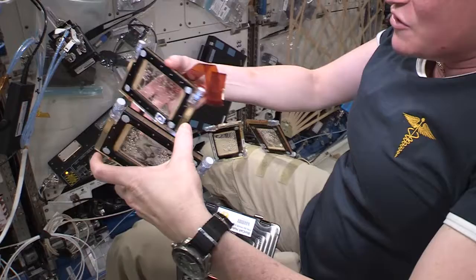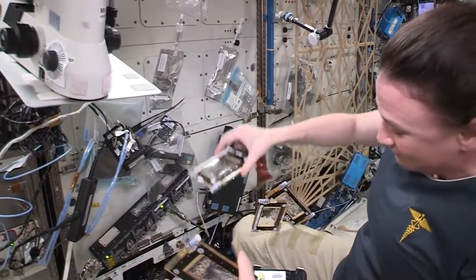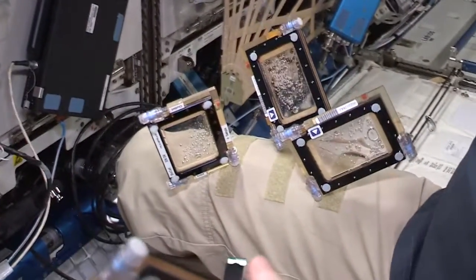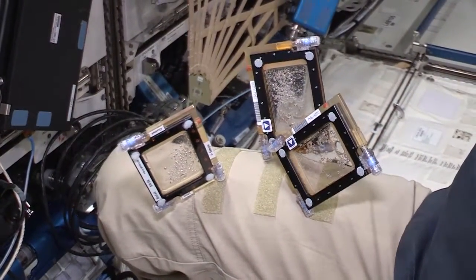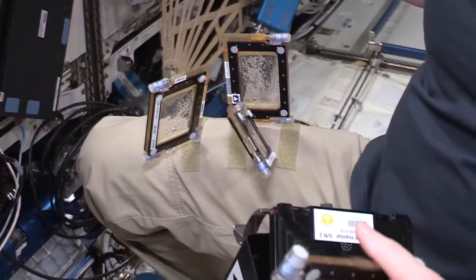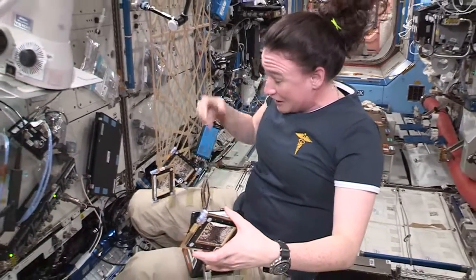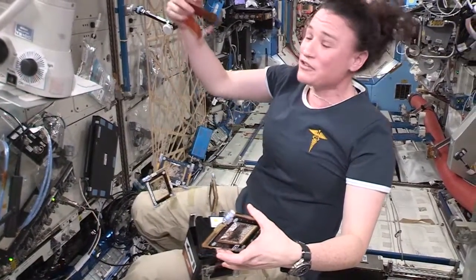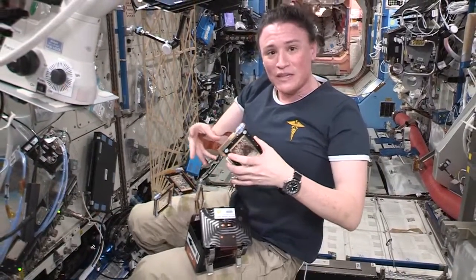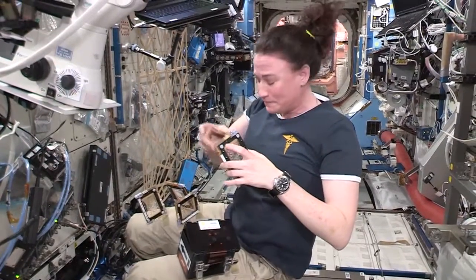So we're going to this new biocell, which is Delta 7. And these biocells here have been treated with varying levels of a cancer chemotherapy drug that is being tested out here on ISS. And so the researchers look at the images that I take for them on the microscope to see how well that drug is impacting the connection between those endothelial cells to see if it will stop this tumor blood supply from growing.